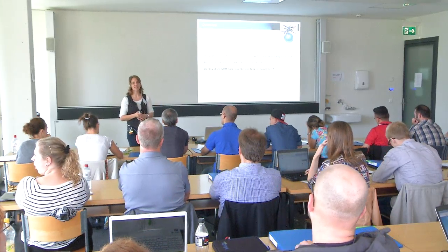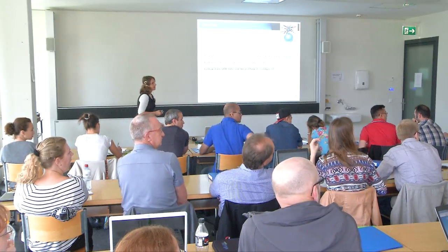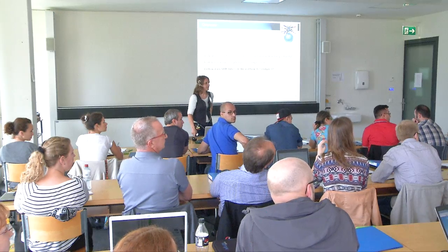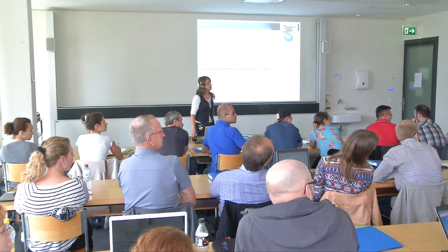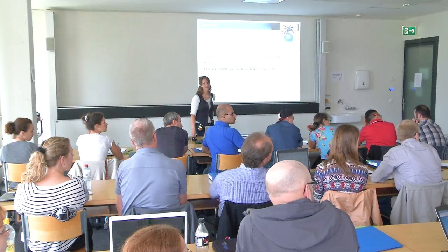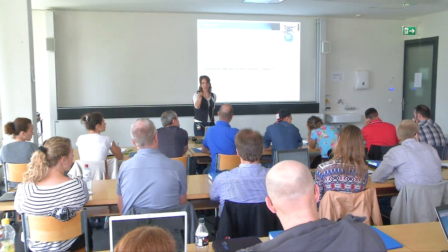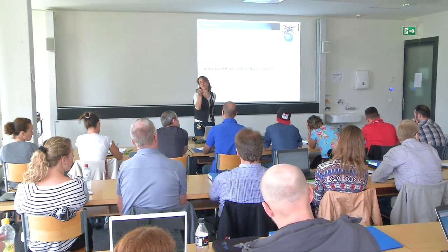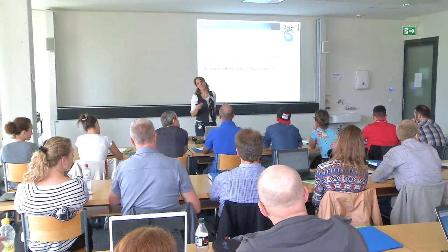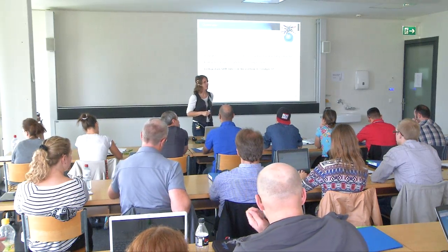For non-human, the problem is... In practical terms in Skyline, there's a function for this. Is that what you're asking for? Yeah, Skyline supports importing the FASTA file and then having a set of peptides and checking the uniqueness against it. Exactly, but it will depend on the FASTA file. And there are different FASTA files, the ones that have this included and the ones that don't. And you must make sure you work with the right FASTA file for you.